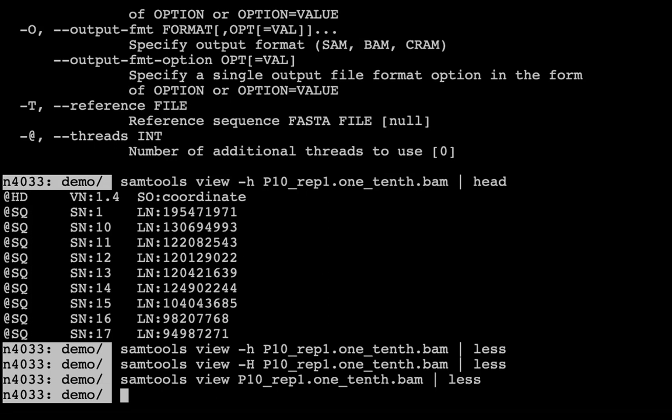But you need to install something on the laptop. You can't do that on the cluster. You're on Mac, so you can just open another terminal that's going to be running on your laptop. Oh, you've done it already. Just open the terminal.